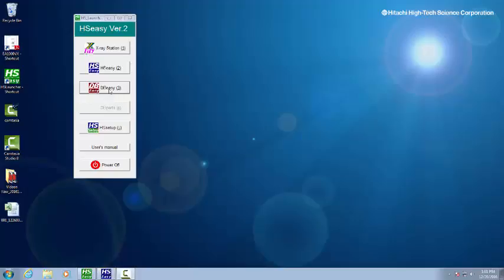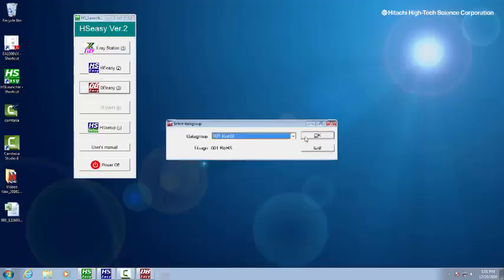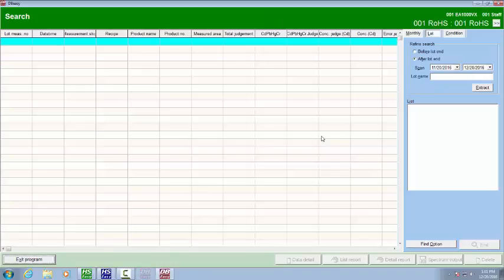Database Easy is where we go to see these reports. I have no password stored on this one, although you can put one on. We did it in data group 001ROHS. You can have multiple data groups. This is the one we were using today.